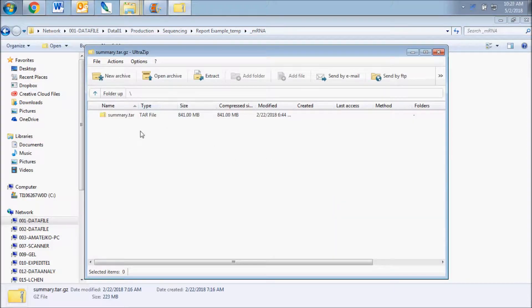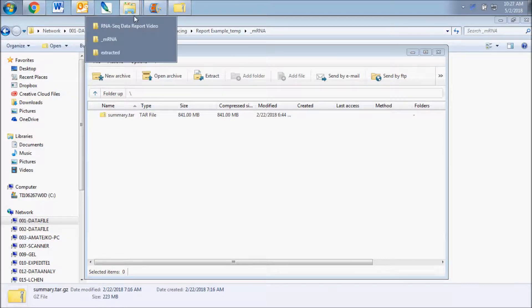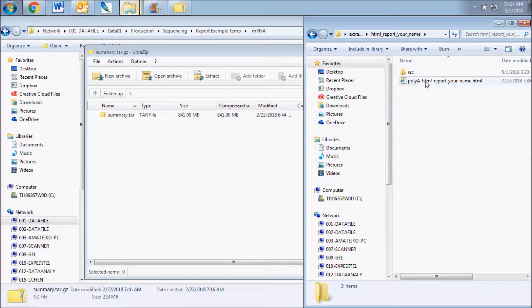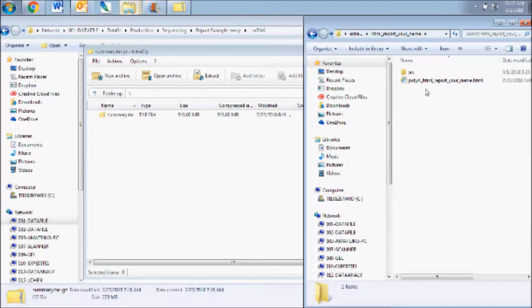You will see one folder titled Report and the other titled Summary. In the HTML report folder, you will find an HTML file and a folder titled SRC. If you move files and/or folders around, make sure the SRC folder stays with the HTML file as it contains the data sources viewed through the HTML file.